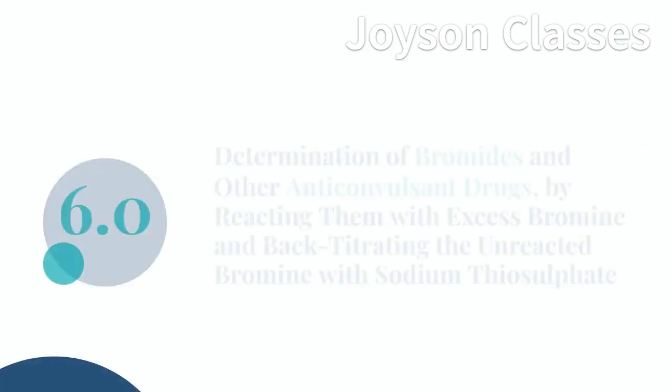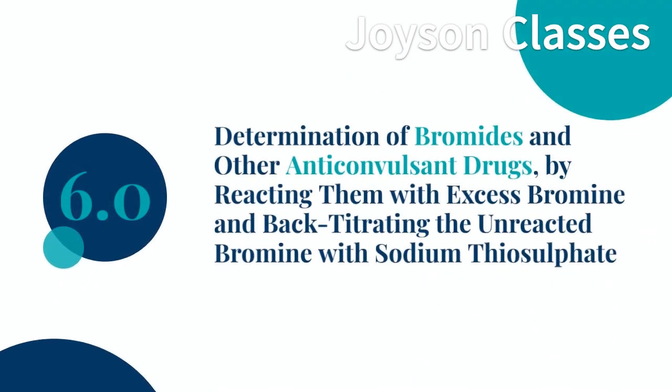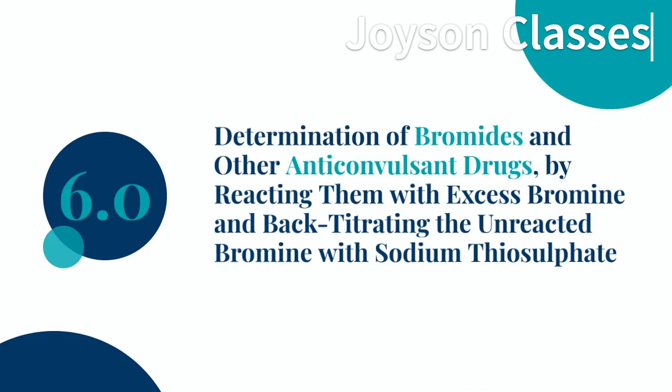6. Determination of bromides and other anticonvulsant drugs, by reacting them with excess bromine and back-titrating the unreacted bromine with sodium thiosulphate.